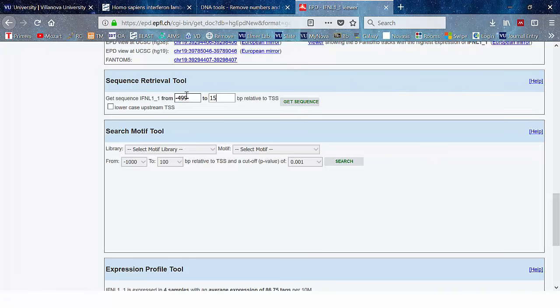And then if I want 1,500 bases total, what I would put in here would be negative 1485, okay? Because 1485 plus 15 gives me that 1500 total bases that I want upstream of that ATG. All right. But since we already have the 15 bases in the transcript, I'm just going to put a 0 right here, and that'll make it easier to append to that transcript later.